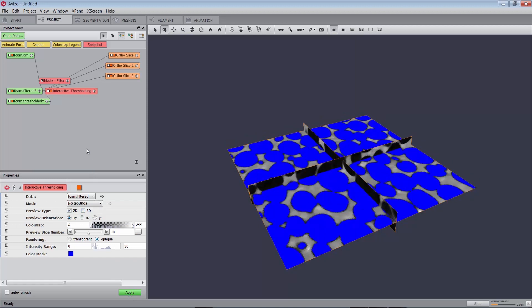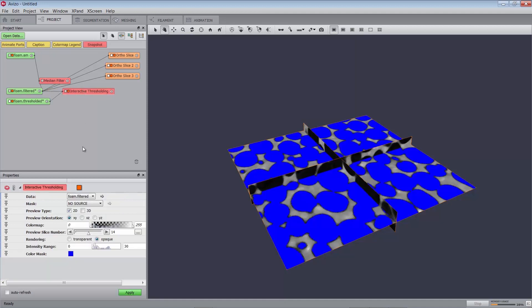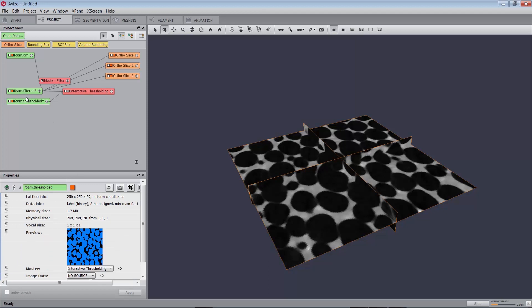The output binary image, named foam.thresholded, is generated in the project view. In the output binary image, all pixels with an initial gray level value lying between the two bounds are set to 1, while the other pixels are set to 0. The interactive thresholding module has created a binary image. For binary images, Amira or Aviso displays voxels of intensity 1 with a blue color. If you attach an ortho slice to the resulting image, an appropriate color map is selected by default. To see this, hide the interactive thresholding preview by switching off the orange visibility button and the module icon in the project view, or next to the module name in the properties panel. Now, connect the first ortho slice to the thresholded data.